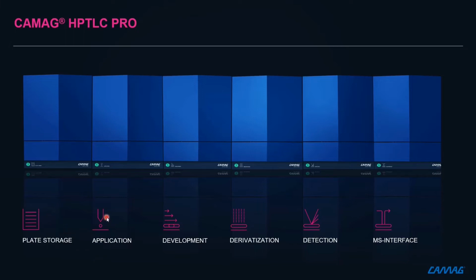The module application uses a spray-on technique for application, and the used microliter syringe is rinsed with 2 rinsing solutions between each sample application.